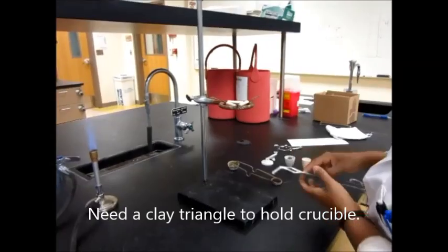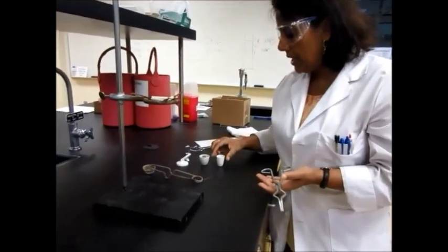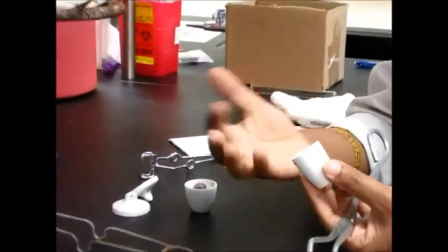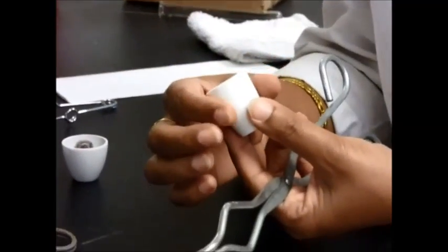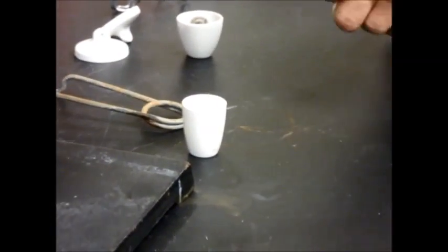You're never going to touch a crucible except for the first time when you have to fire a crucible. Other than that, you will never touch a crucible with hands because otherwise your hands will leave oil on the crucible and it will get contaminated. After the first time you never use your hands, you will always use the crucible tongs.